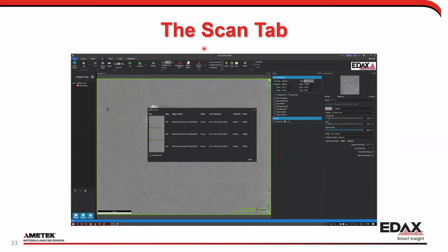Actually, a good question. From you're using TEAM, the grid type is stuck with square type when using combo scan. Is that the same with APEX? Yes. The answer is when you combine data sets, you can't really line up hex grid systems easily. So yes, the square type is used in combo scan mode. Good question.